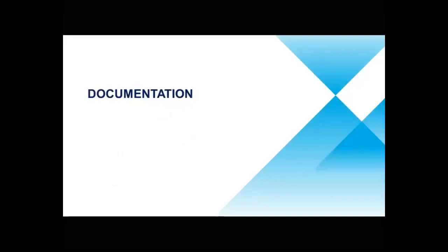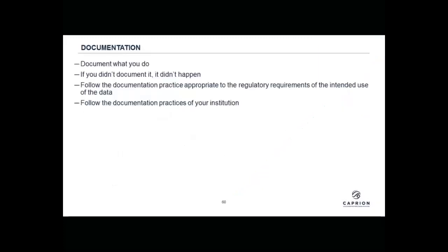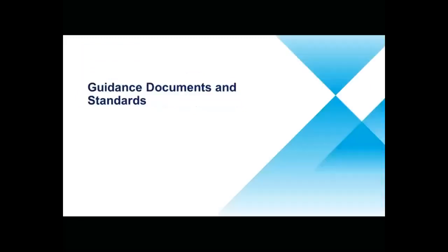Okay, so let's talk about documentation. This is a short one, so don't worry. Basically, in a regulated lab, and really in the best research labs, you document what you do. If you didn't document it in a regulatory setting, it didn't happen. And like the overall quality practices, you need to follow the documentation practices that are appropriate to the regulatory requirements of the intended use of your data. And you need to also follow your institution's practices. So that's all we have on documentation.